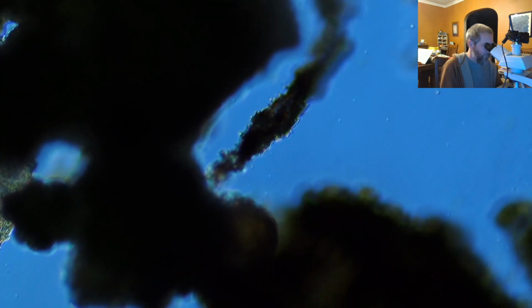So here's another water bear. I think that's the one that we had originally. It looks like it's on the same piece of junk as the other one, or close to it.